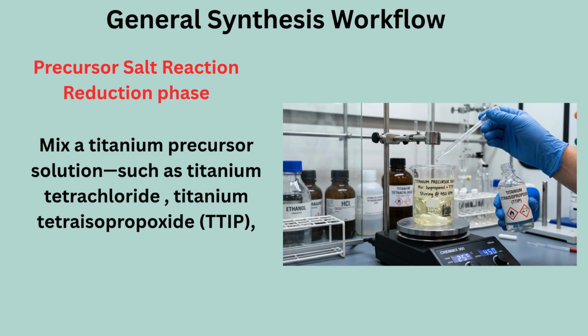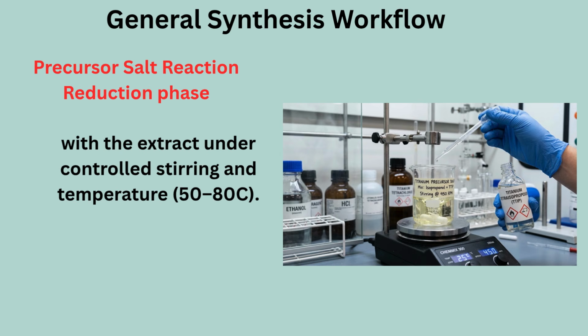Mix a titanium precursor solution, such as titanium tetrachloride or titanium tetraisopropoxide, TTIP, with the extract under controlled stirring and temperature, 50 to 80 C.